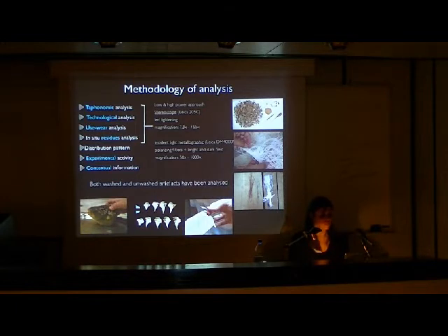And I was very lucky because, as you will see, the residues were very well preserved, so an in situ analysis of residues has been carried out, and taphonomical, technological, use-wear and residue analyses were carried out with a low and high power approach, using polarizing filters and bright and dark field analysis.